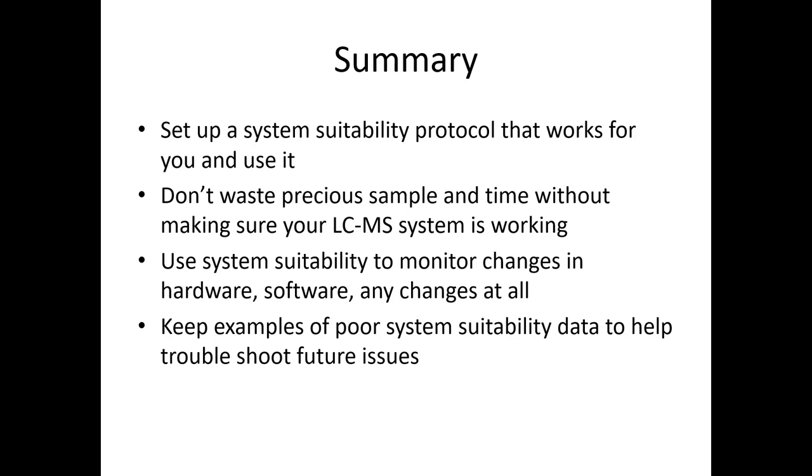So if you start plotting it out, you can again begin catching things before they become dire, right? Because we don't want to wait on the engineer. You call and they're like, oh, we'll be there in 3 days. And you're like, I need you now. And some things are things that you are able to do, like changing rotor seals. It's really not that hard. I don't know, changing your solvents, right?